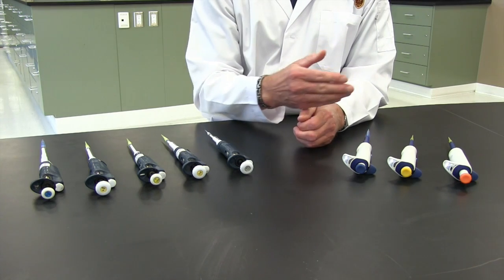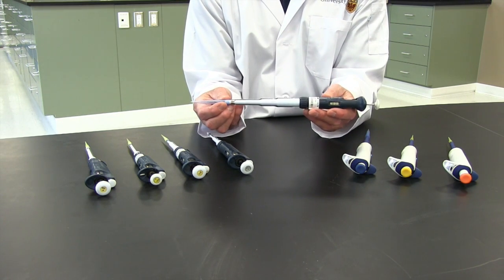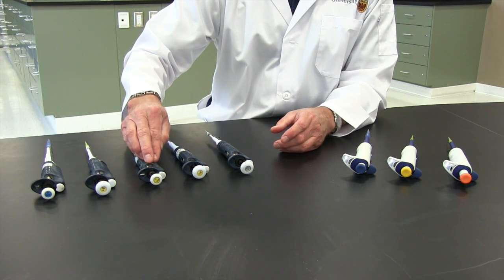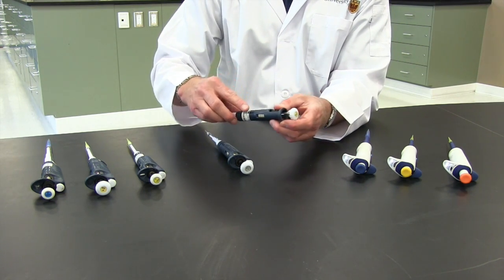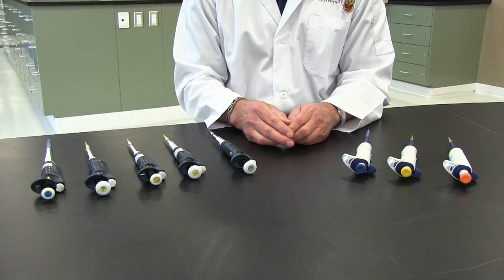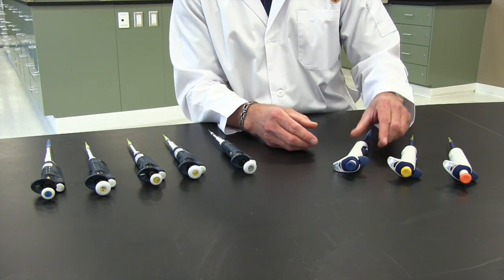As I mentioned, there's a range of different pipette sizes that you can use in the lab. And the caps are color-coded to match the tips that go on the bottom. So P1000 is blue on the top to match the blue tips. The 200, the 100, and the 20 all have yellow caps to match the yellow tip on the bottom. The P10 has a white top and matches the white tips. This is a Gilson series of pipettes, and this is a Biohit series of pipettes that you'll be using in the lab, but the same color code applies.